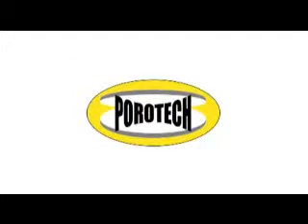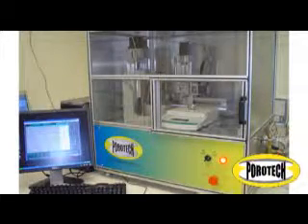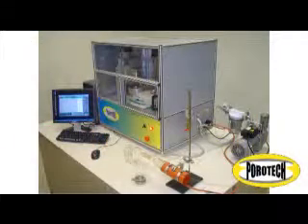Porotech Limited is a company specializing in the characterization of porous materials. By utilizing the method of standard porosimetry, we are able to provide you with unique information about your materials. The company offers laboratory services and manufactures the Automated Standard Porosimeter.